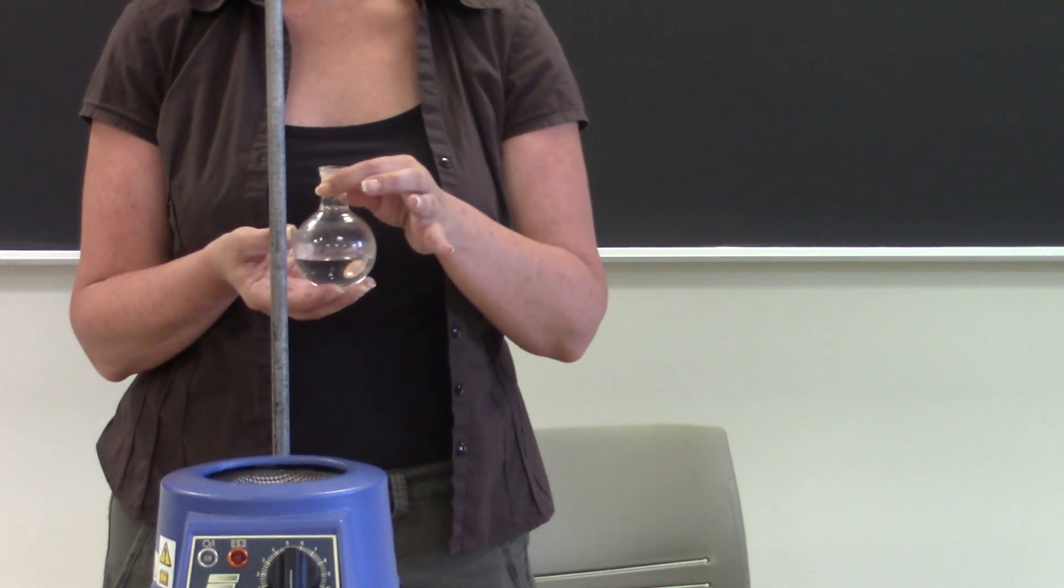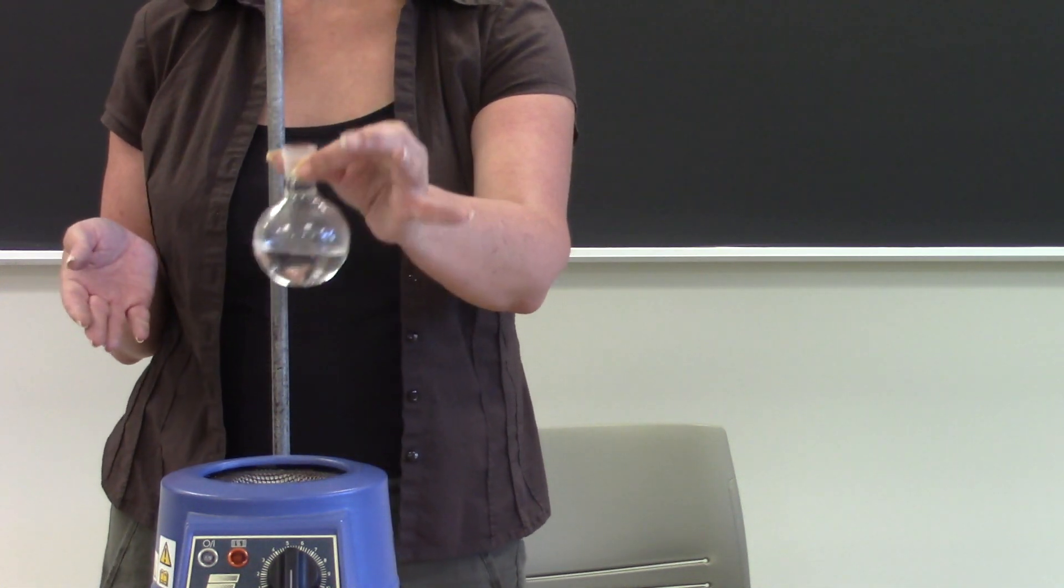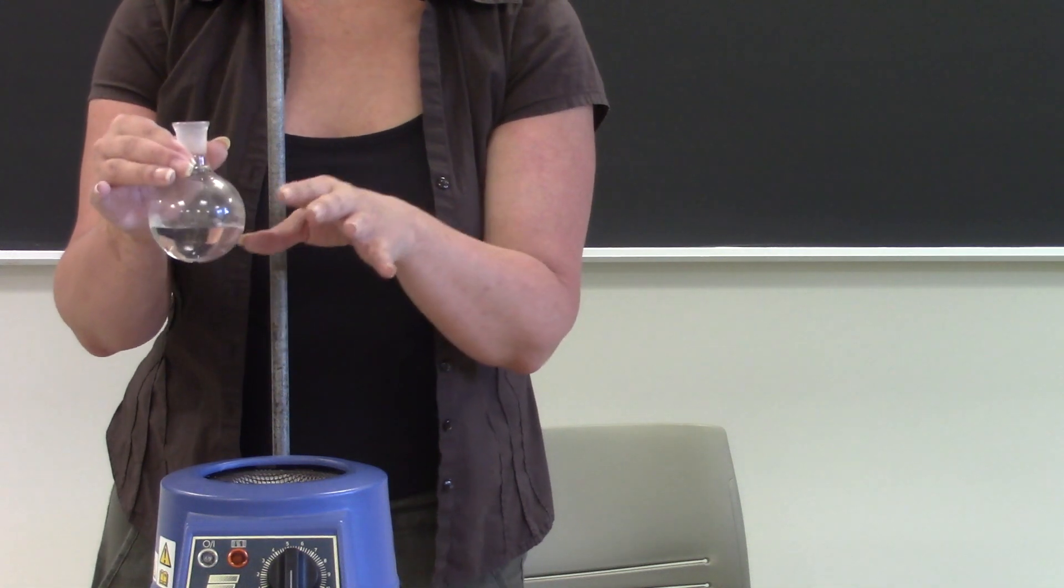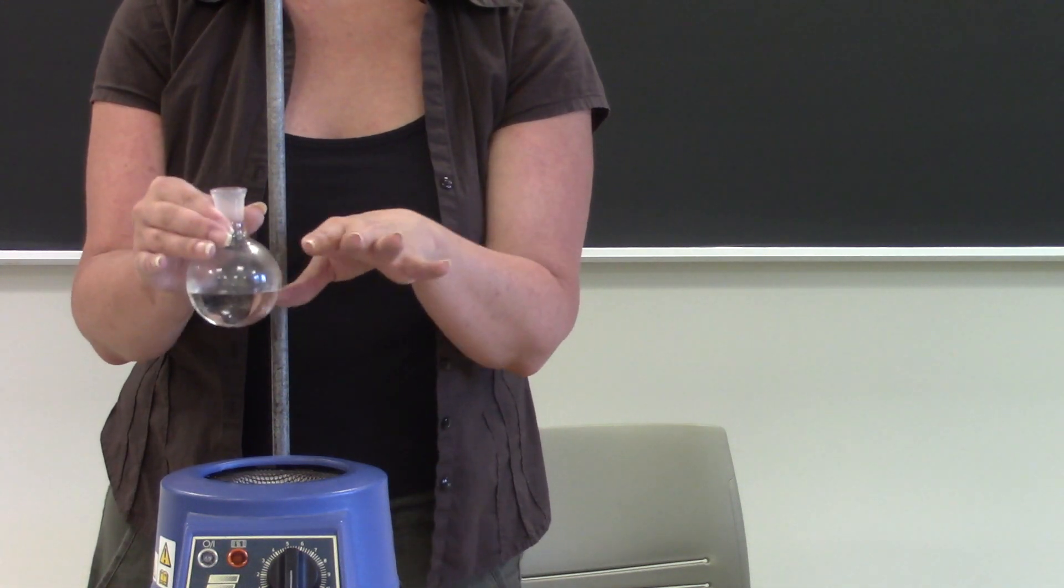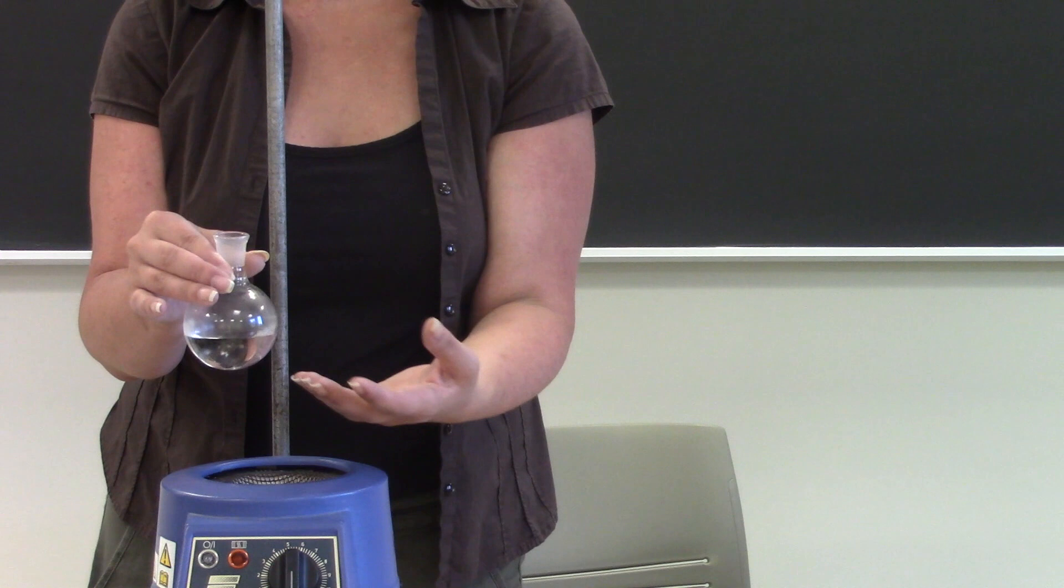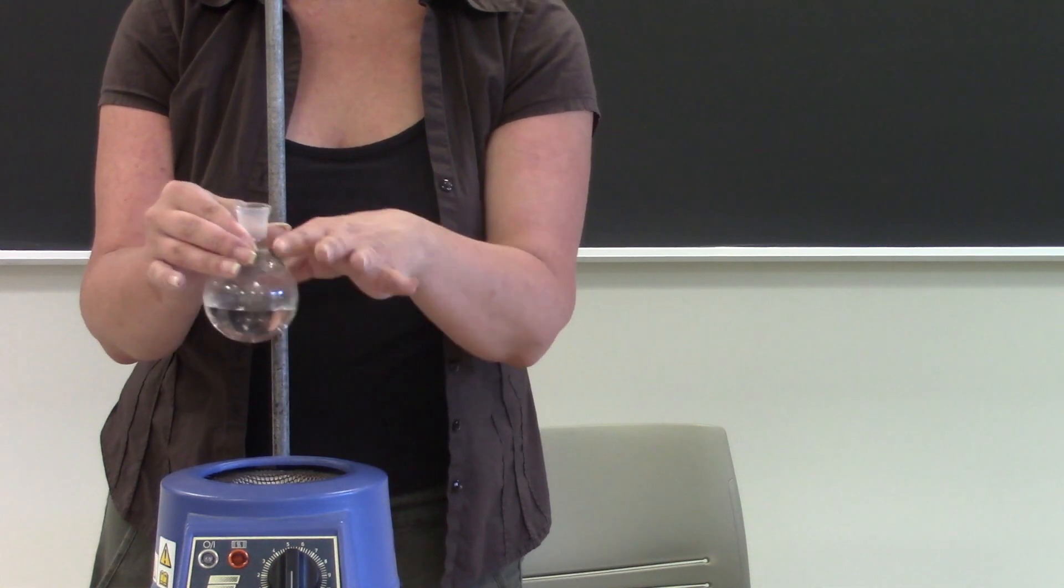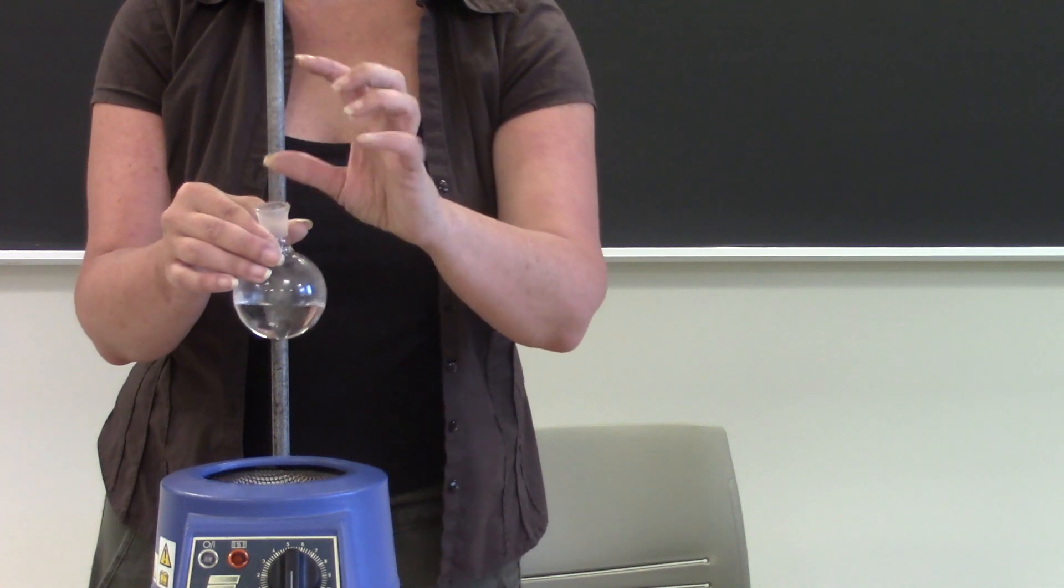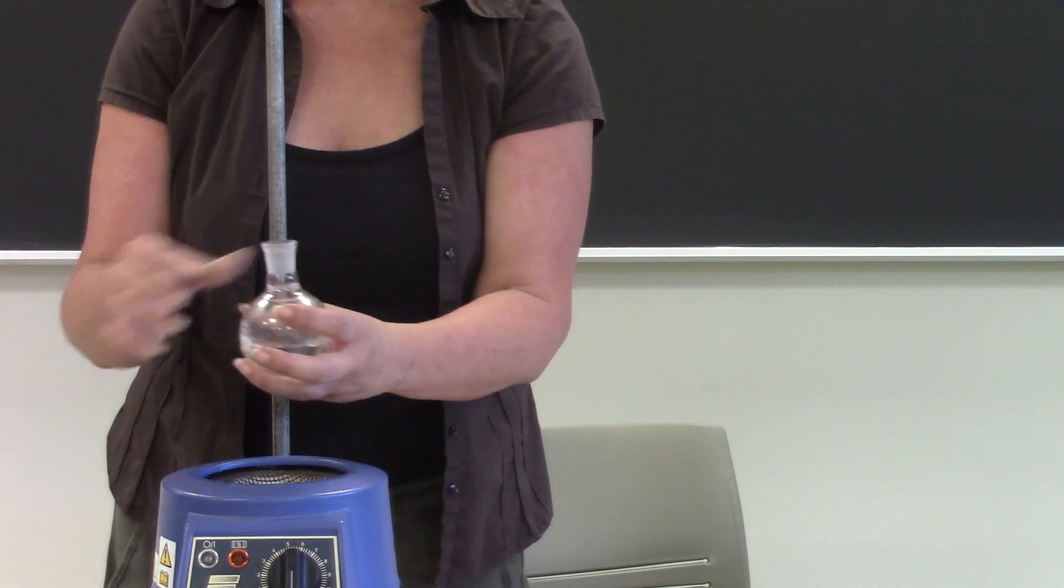So the first thing that you're going to put on is your round bottom flask. Make sure when you're using a round bottom flask for a distillation you never fill the flask more than half full that way when it does boil the bubbles are going to be contained inside here. We don't want anything to gas to be above the round bottom flask.